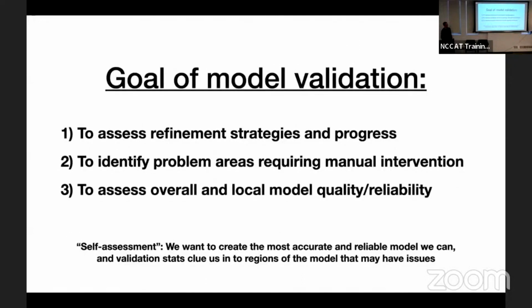Okay. I probably should talk about validation first because it's so important, and I always sort of run out of time. Validation is really important, and it's not just to make a final model with good stats so that no reviewers question you and everyone looks at your structure in the PDB and says what a great job you did. It's really also to help you, during the model building and refinement process, to make the best possible model you can.